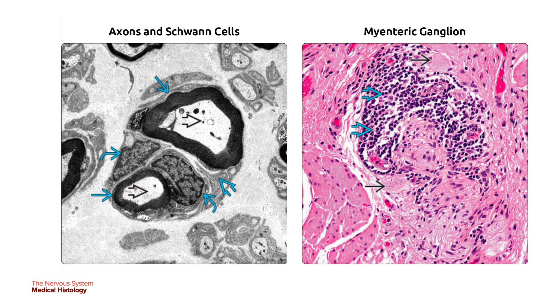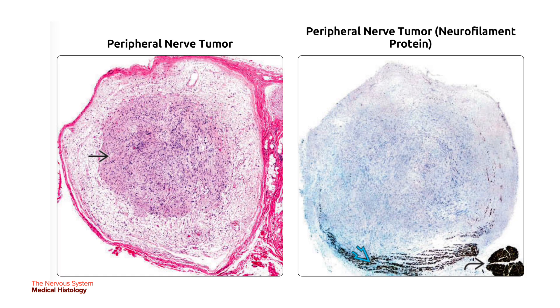On the left, axons in the bold black arrow are surrounded by myelin sheets in the single blue arrow produced by your Schwann cells. Schwann cell nuclei in the curved blue arrow and cytoplasm in the bold blue arrow with abundant endoplasmic reticulum are also seen. On the right, this section from the colon wall shows the Auerbach's or myenteric plexus — a collection of ganglion cells in the single black arrow in the enteric nervous system. Increased numbers of lymphocytes in the bold blue arrow are abnormal. Also shown is a schwannoma displacing normal nerve fibers to the periphery, confirmed by neurofilament protein staining.